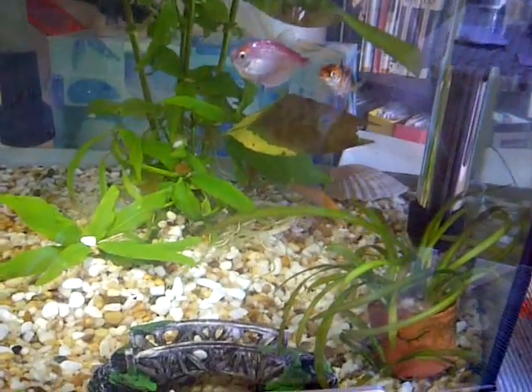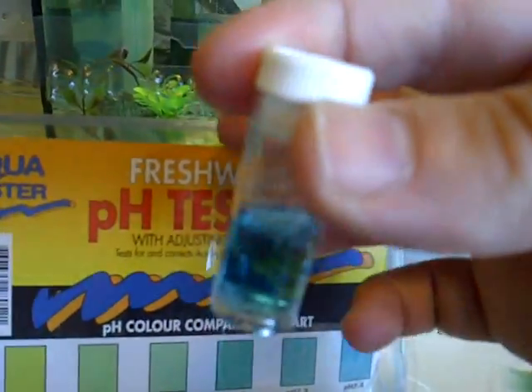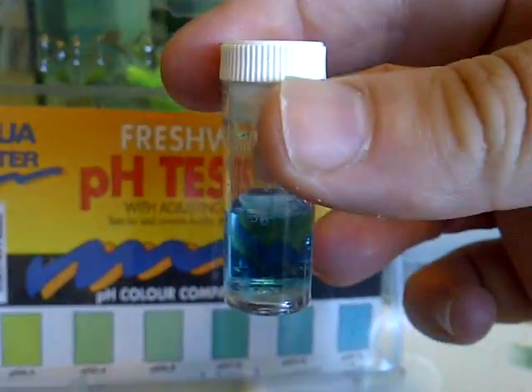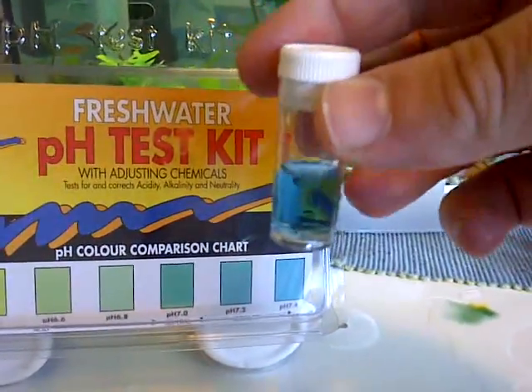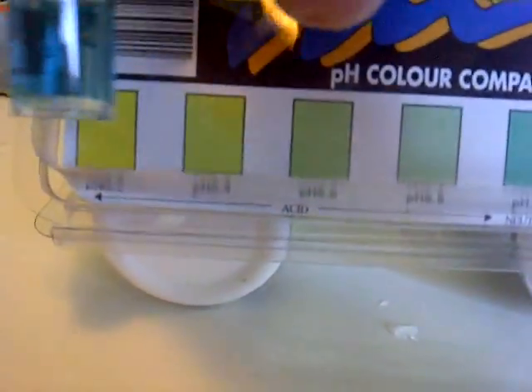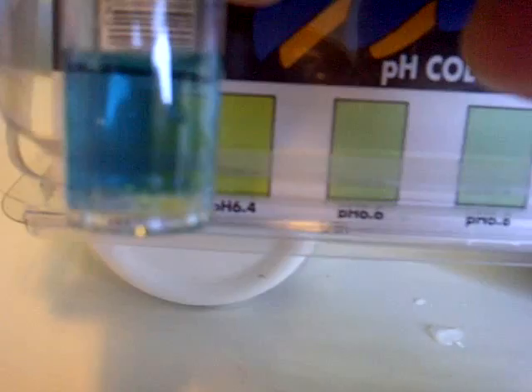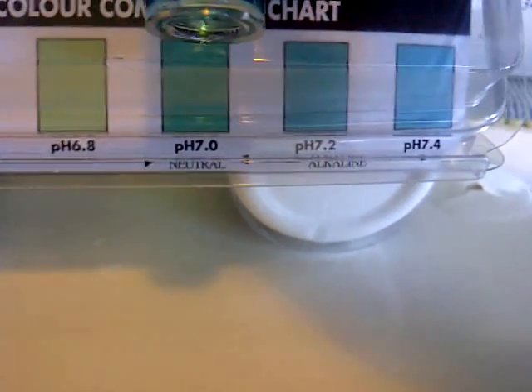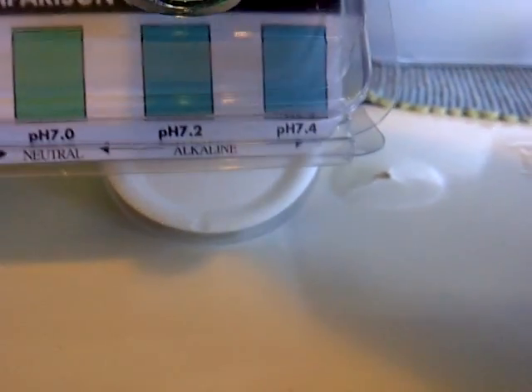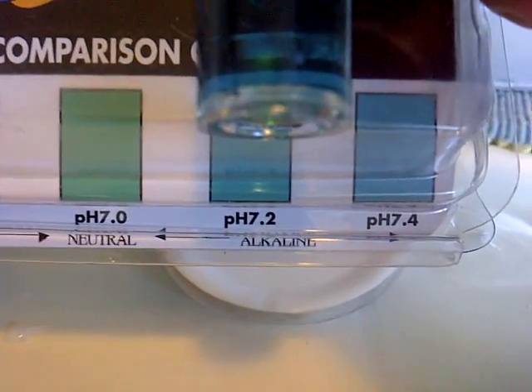Now if we come back down here, we'll be able to do the test. It says to tap this twice to make sure the color is uniform across the water. We can see we're definitely not working with pH levels of 6.2 — bringing it up to the chart, this is probably more akin to this color here, so we have an alkaline sort of water in our tank.